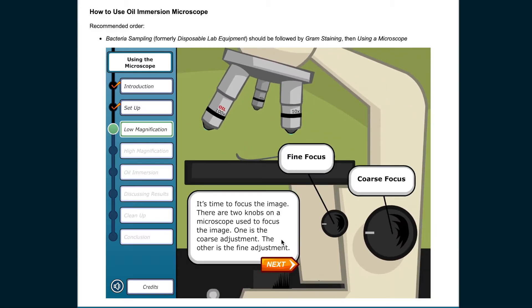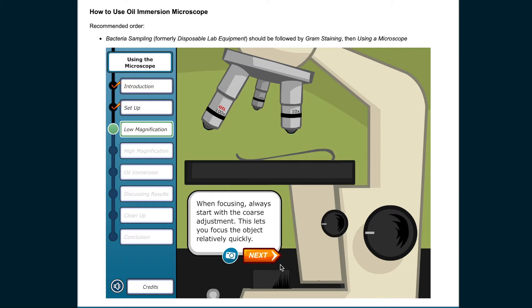It's time to focus the image. There are two knobs on a microscope used to focus the image. One is the coarse adjustment. The other is the fine adjustment. When focusing, always start with the coarse adjustment. This lets you focus the object relatively quickly.